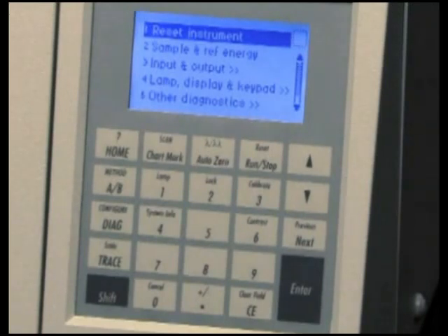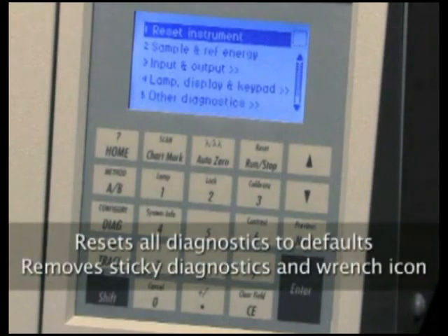Use the arrow keys to scroll through the list, or press the number of the diagnostic you want to select. For example, selecting Reset Instrument resets all diagnostics to defaults.